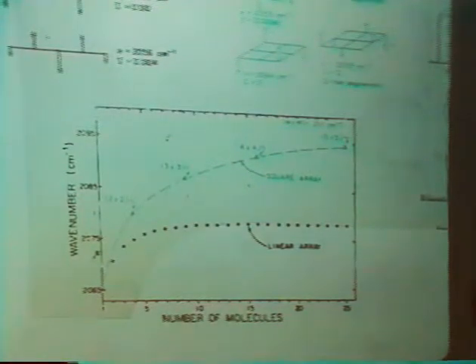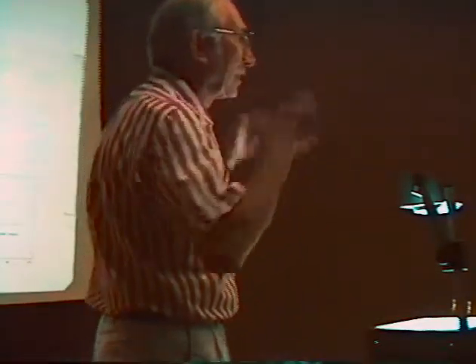Again, I want to emphasize the magnitudes of the shifts. As we go from one mode to the other, the frequencies, the wave numbers, vary by 5 or 10 wave numbers, and the kind of shifts that you get for a few molecules put together is of the order of 10 or 20 wave numbers.